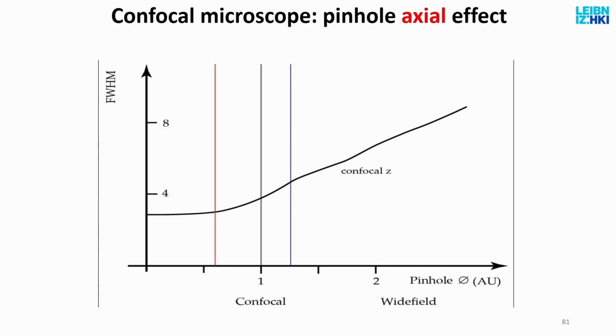So since we only have 3 hours, we could only cover the basics and the confocal, but in the other 3 hours, you could go through these super resolution techniques. But yeah, if you have questions, just ask and you can get these answers online. But based on this, you should also understand how these things work.